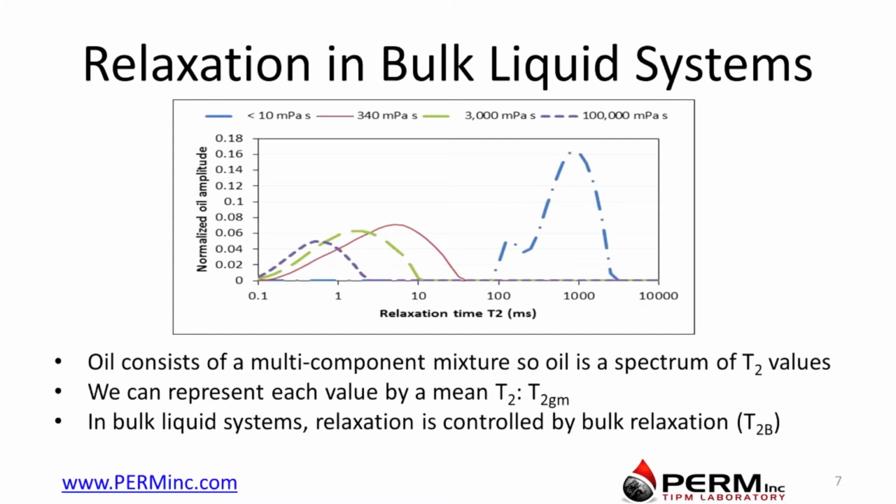And the reason for that is that as viscosity increases, molecules become much more complex and closer together, and they will very quickly come into contact with each other, give off their energy, and go back to their equilibrium. So the more complex and interwoven the molecules are, the faster they will relax, and this is also a more viscous fluid.